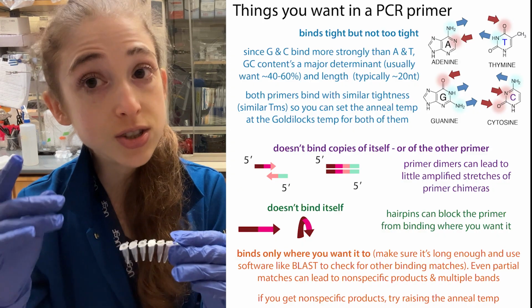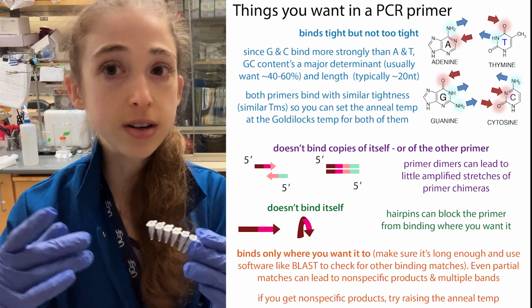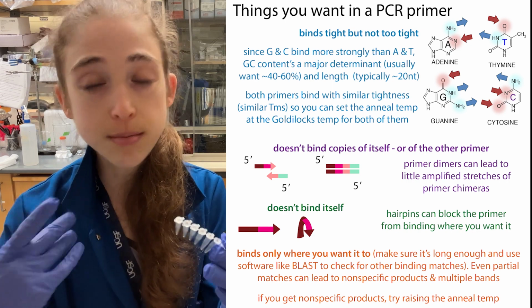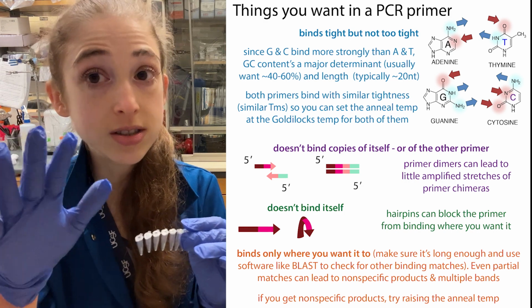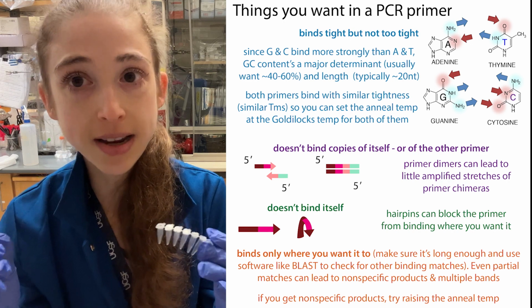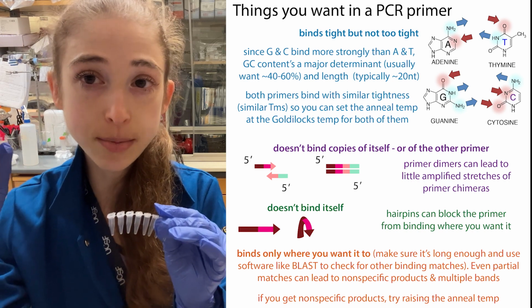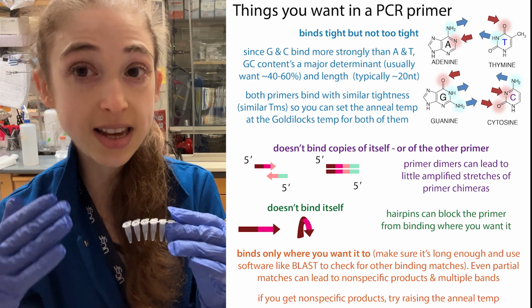But what you can also do is change your primer. And so, although this means, yes, you have to design a new primer and order a new primer, if you're not having luck with the other optimization methods, this can be a good bet. You can also make sure that when you're designing your primers in the first place, you make them ideal for this. So we talked about the annealing temperature and how we could adjust it, and how that was related to the melting temperature, the TM.